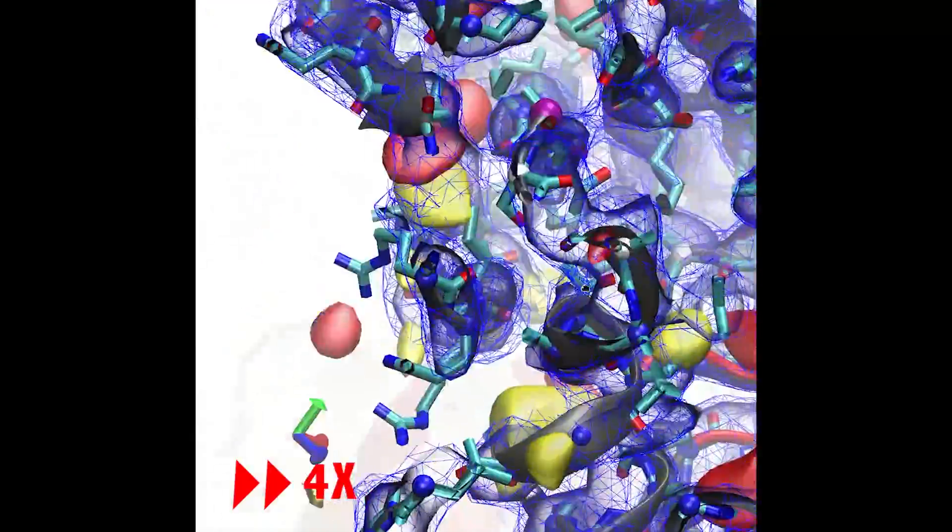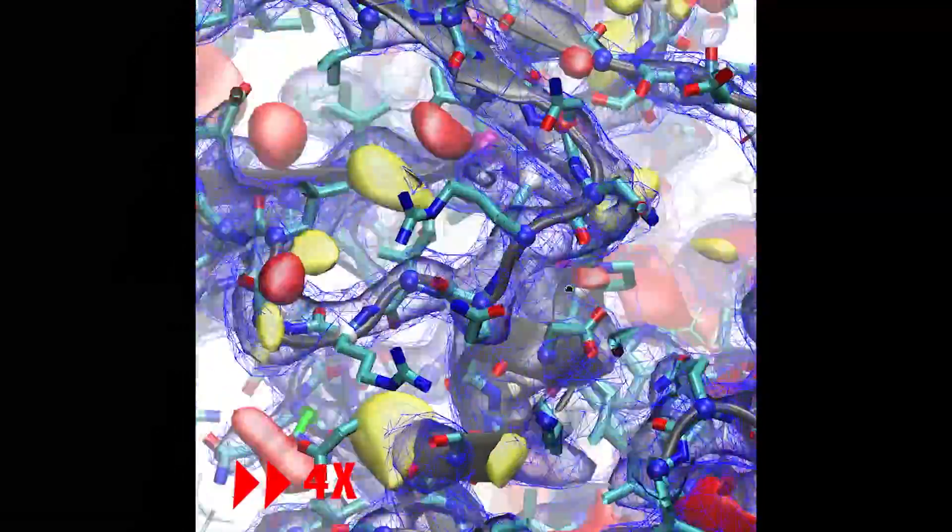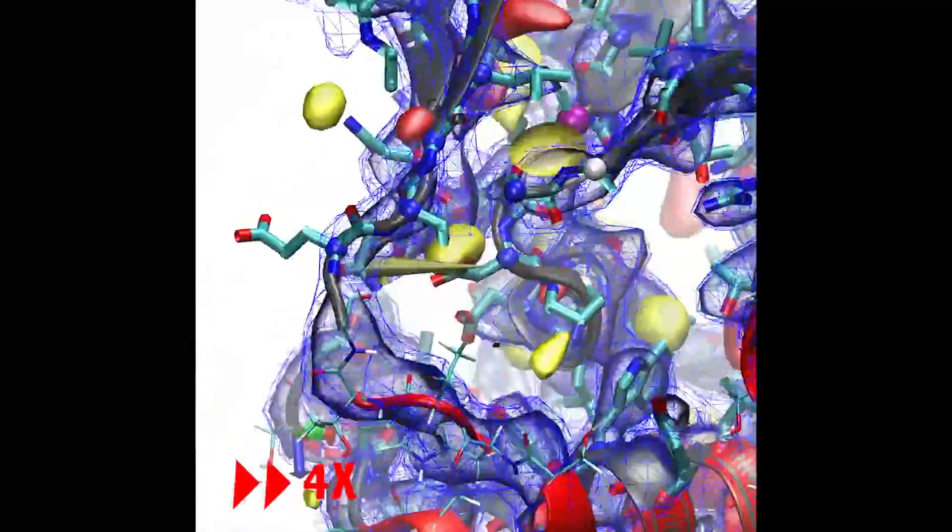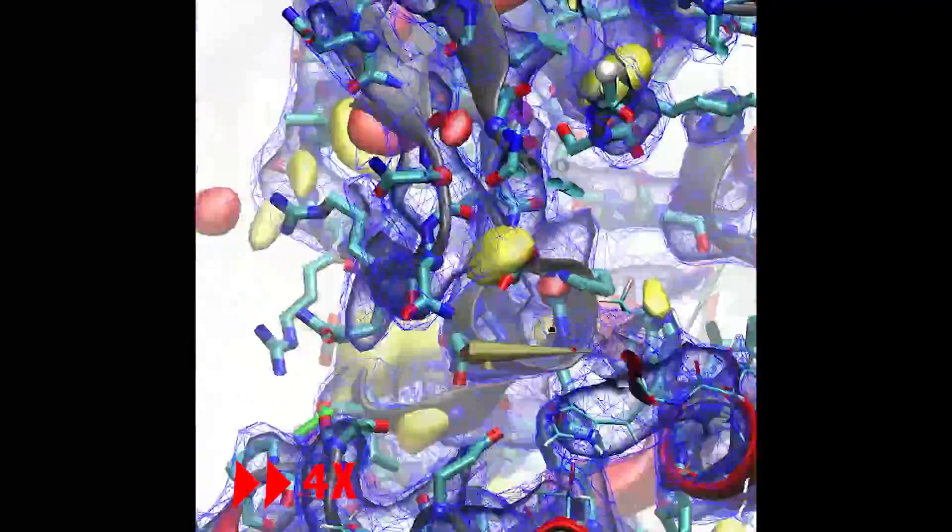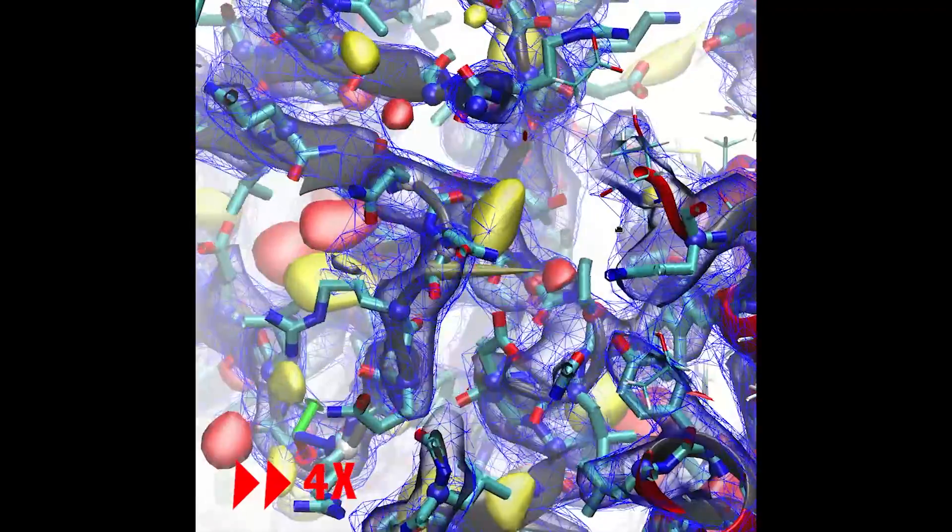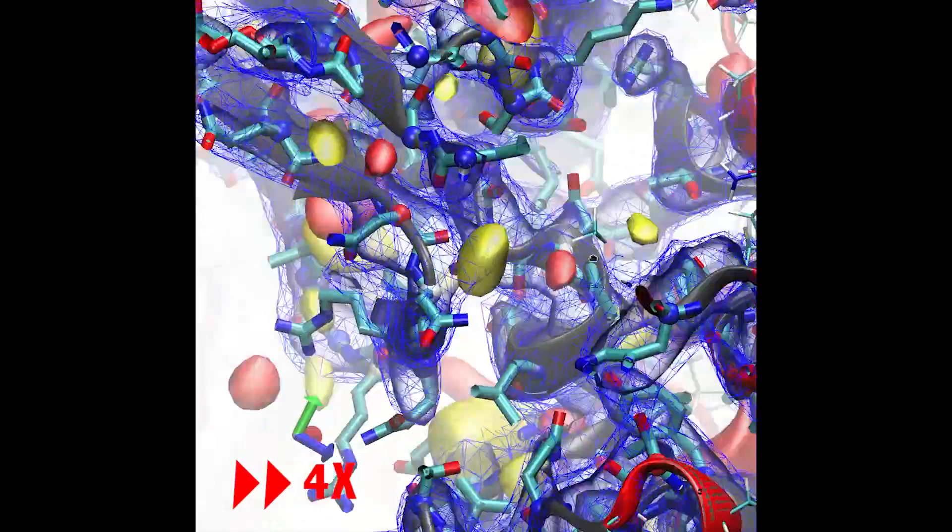You may have noticed the colours of C alpha atoms changing from blue to white to red. This is a real-time track of the Ramachandran status of each residue, with red being an outlier, white allowed and blue preferred. You can also see the secondary structure updating in real-time, which I find to be a very useful indicator of progress.